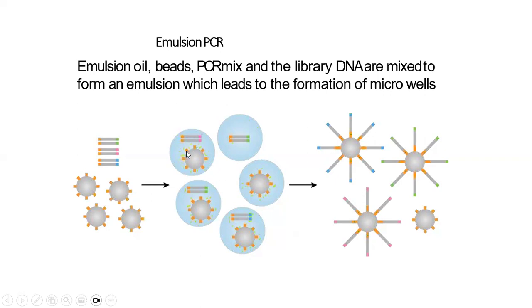On the surface of the beads, there are actually two types of primers, as we had seen that DNA has two ends. Both ends of the DNA are able to bind to the two different types of primers attached on the surface of the bead. Although in the diagram we can see only one color, you actually have two different types of primers. These DNA fragments attach onto the primers, and then the extension reaction takes place, which results in multiplication of the fragments. At the end of the process, one fragment is converted into many copies of the fragment attached to the surface of the bead.